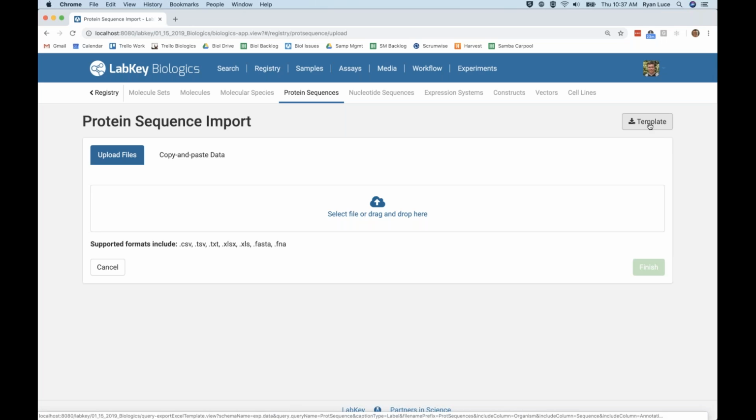Yeah, so it does not necessarily have to start with an entity, although we also might create entities to represent that specific workflow. This configuration has these entities, but you can add additional entities, and we would work with you in that situation to do that. It's very straightforward. We would just want to make sure it's set up appropriately. But it doesn't have to be. These workflows can start from a sample or other aspects as well. I'd want to get a little bit more into the specifics, but I'm very confident we'd be able to address the specific needs of your scenario.